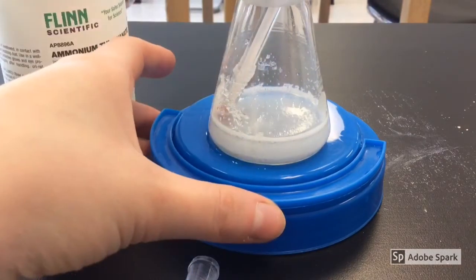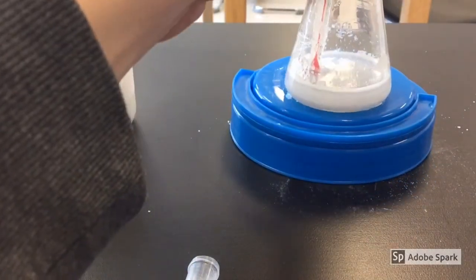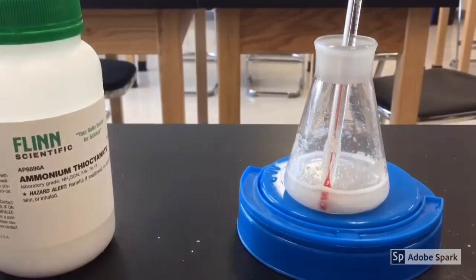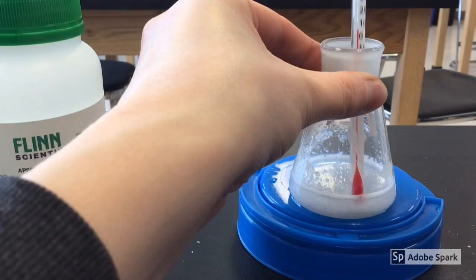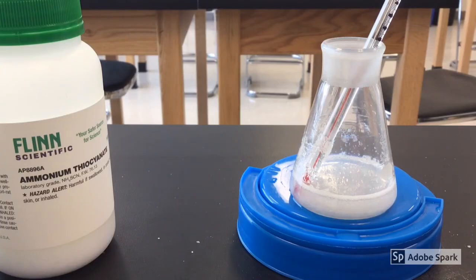I've let this sit for about five minutes now after it totally froze, and you can already see it sliding around. The water is no longer frozen and the temperature has been raising back up again. Now it's about 5 degrees Celsius and it will continue to increase as this reaction is completed — so it can change back and forth.